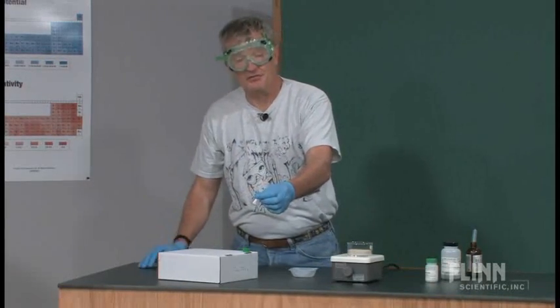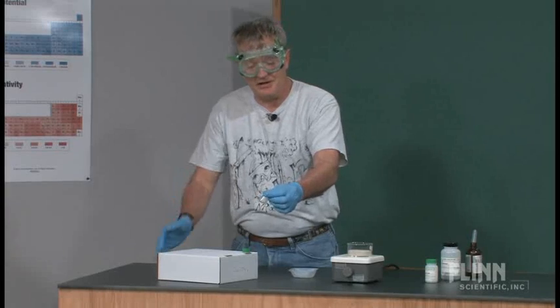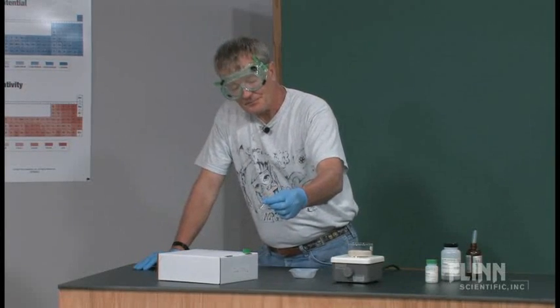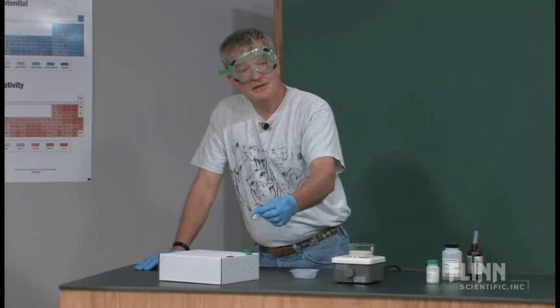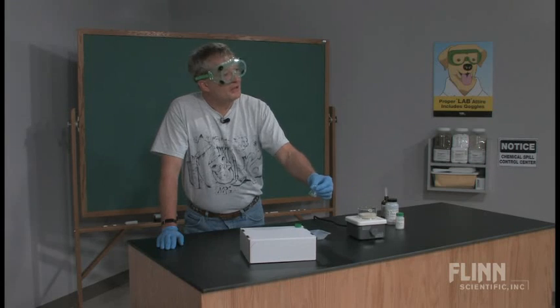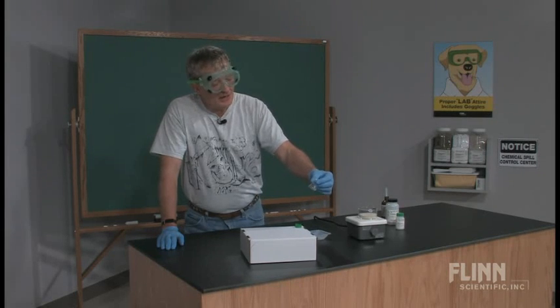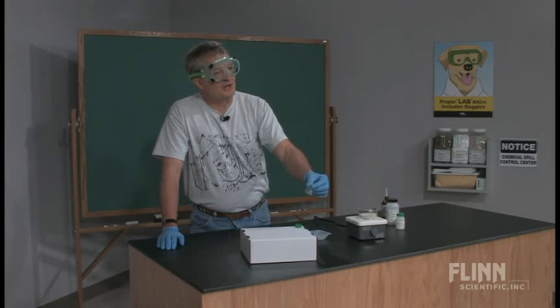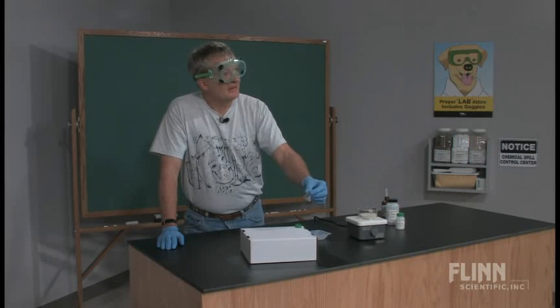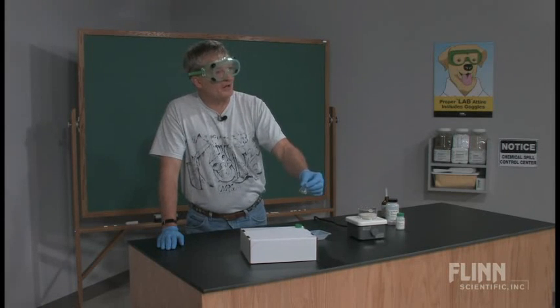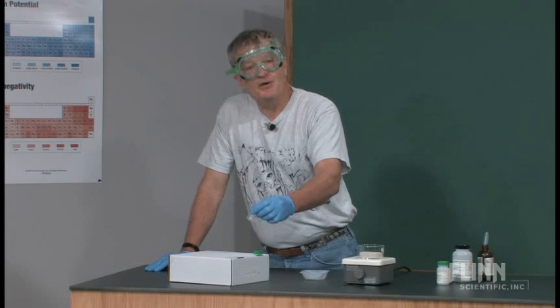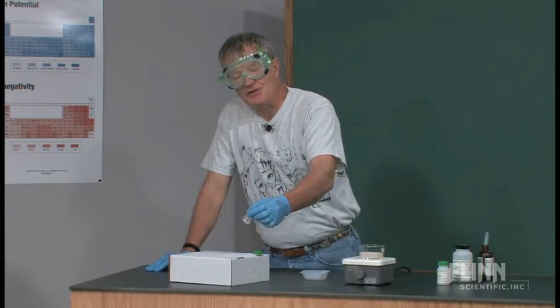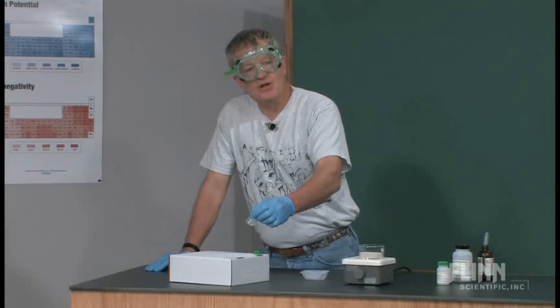What I discovered was that if you do it over top of a Bunsen burner, you heat it too fast. The compound that's produced in this thing is heat sensitive and it breaks down. And so instead of getting the desired product, you end up with some black junk stuck in the bottom of the flask. So you need a way to evaporate the liquid a little slower.